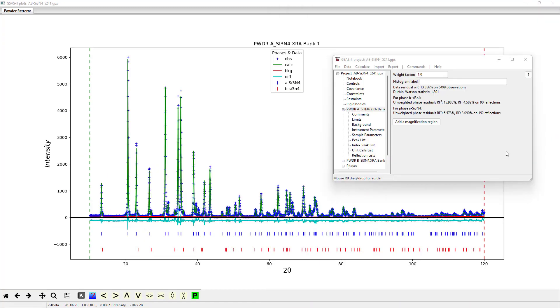Consequently, I developed a new feature for GSAS-II that allows the user to easily export the model parameters in bracket notation.